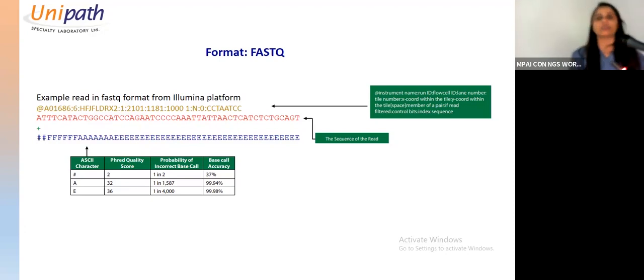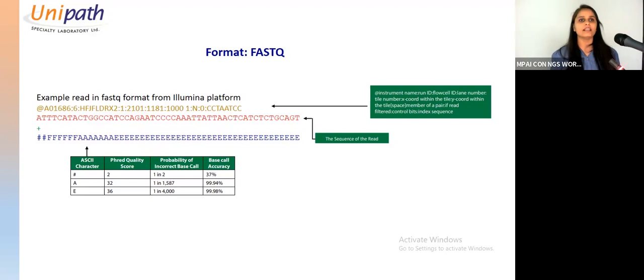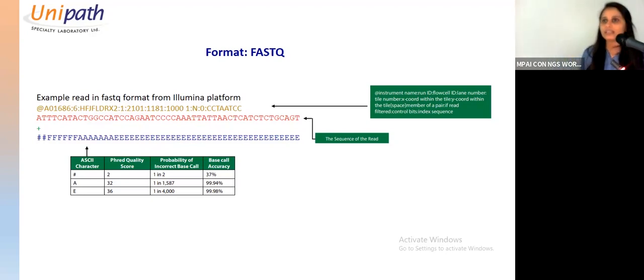Now, quality, though it seems alphanumerical, actually represents a number from 1 to 40. If you see Phred encoding, you'll see that this quality represents a number from 1 to 40, though it is shown as alphabets and special symbols. In FASTQ, it has been converted like this just to reduce the size of the file, nothing else.